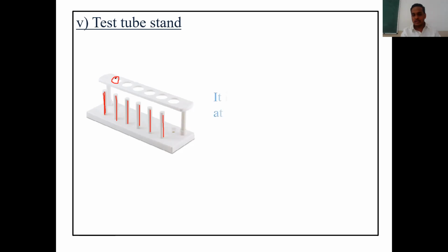Okay, so the use, as I told, it is used to keep test tubes at one place. You cannot keep them here and there. Test tube stand will be provided. In that particular test tube stand, keep all the test tubes which have been provided for you people.